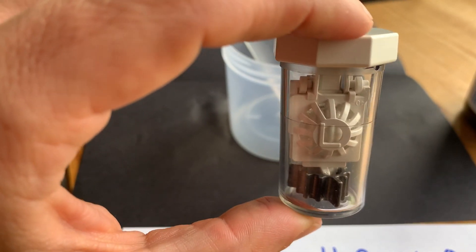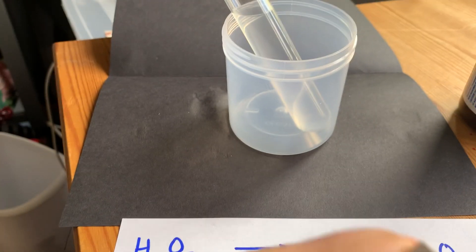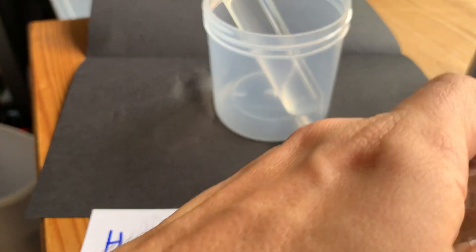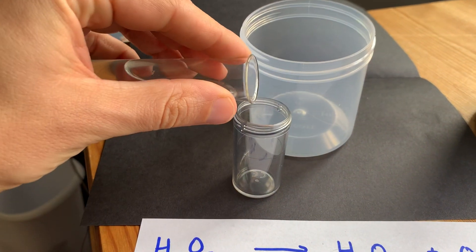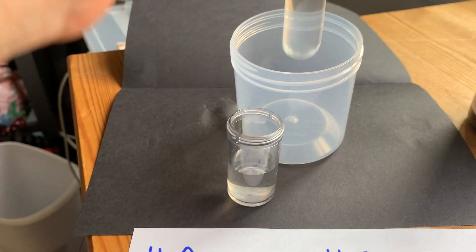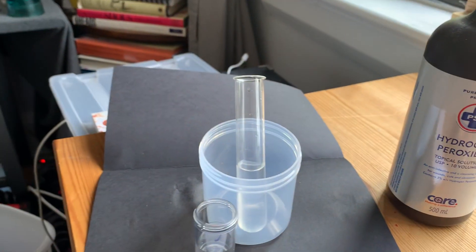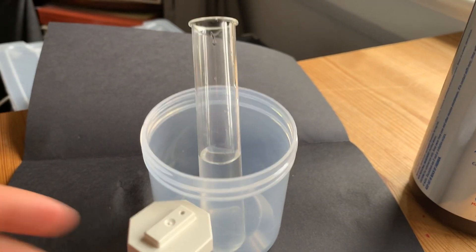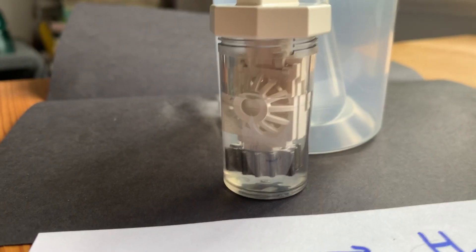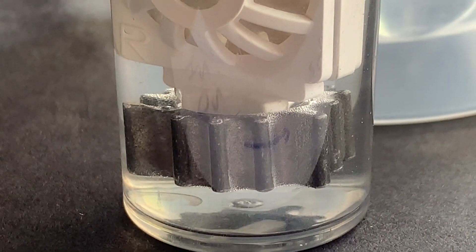I'm just going to take the lid off of that. I'm going to pour some hydrogen peroxide into the plastic, and then I'm going to resubmerge that piece of metal. If we zoom in here, you might be able to see some bubbles coming off of it.